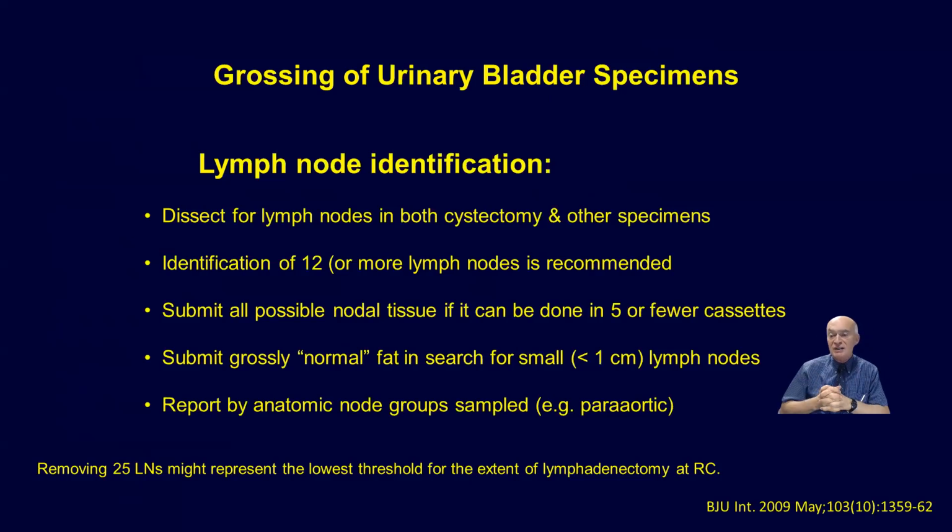Many surgeons are careful about that. And if you provide them only 2 or 3 lymph nodes, they're going to complain, and sometimes we have to go back to the bucket and try to get more lymph nodes for evaluation.